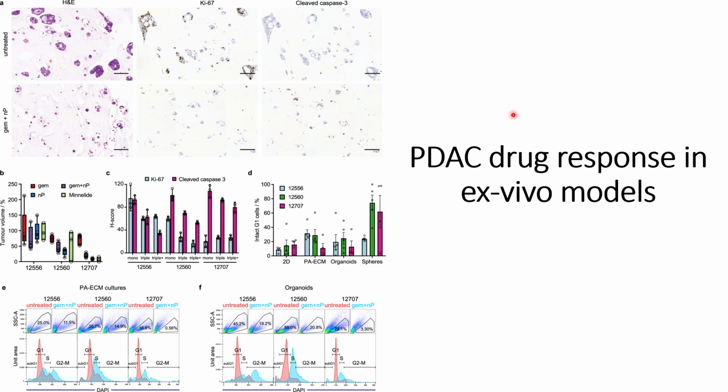Today we will discuss the final figure that is presented in this paper, where they have developed a custom designed PA-ECM model to culture the pancreatic cancer cells, and its characterization more closely resembles the in vivo pancreatic cancer tissue.